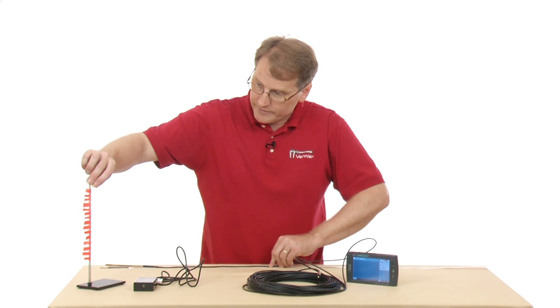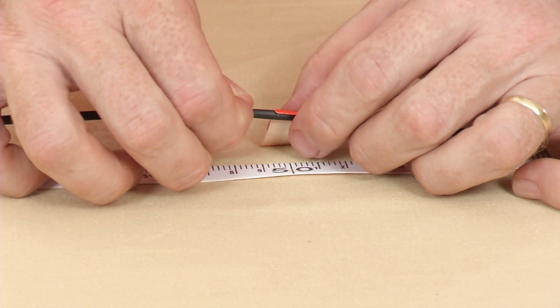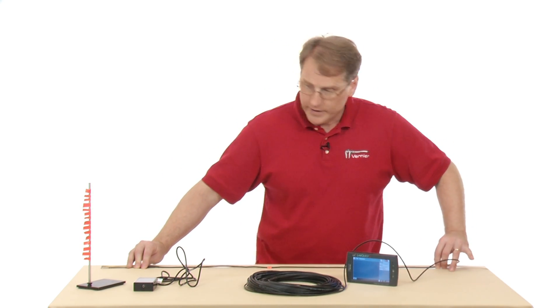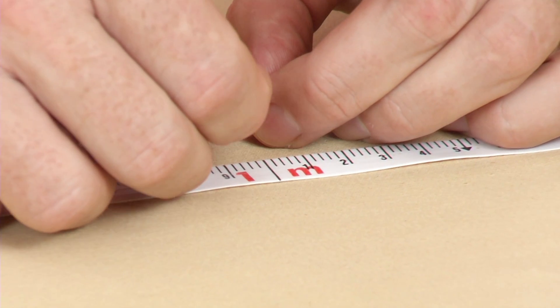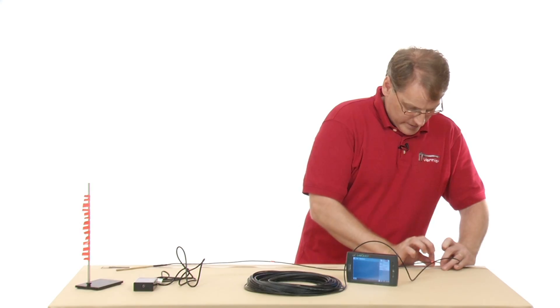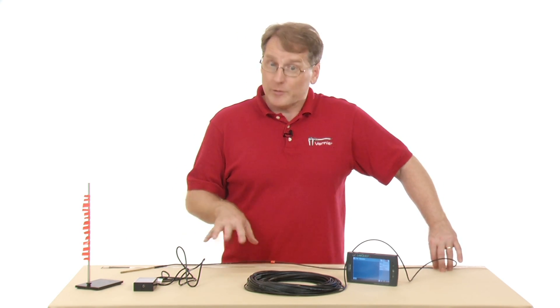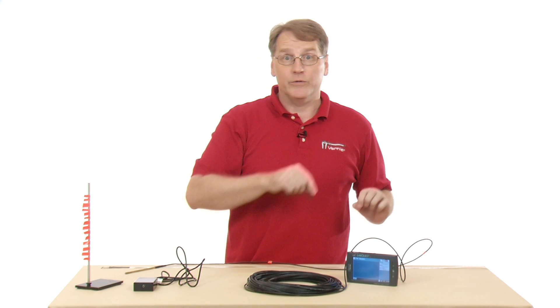I'll mark it off from the end, coming down to the 50-centimeter mark, and place a piece of tape there, centering it on the wire. Then I'll move down to the meter mark and place another piece. I'll continue marking in this method. If I were doing this with students in school, I'd probably run the tape measure out down the hall alongside the cord and have them measure it that way — that's probably the better method.